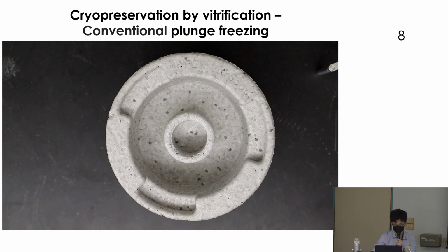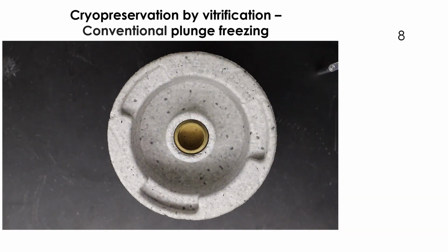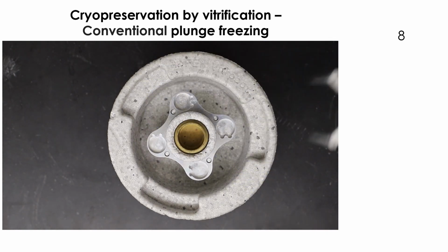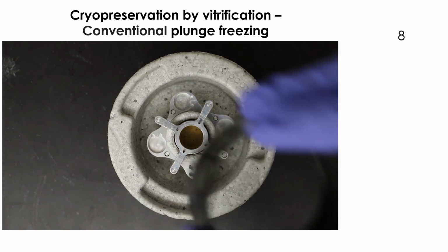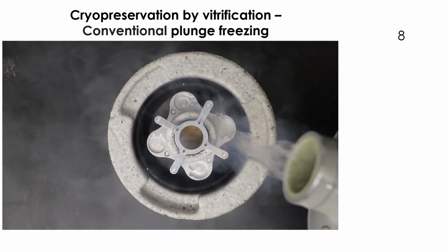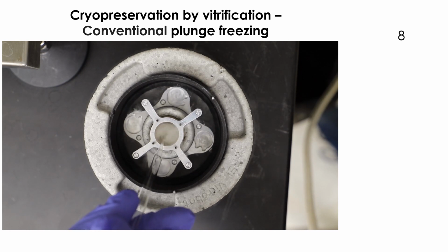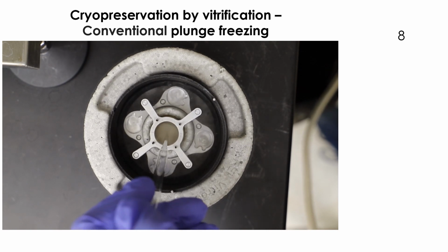Okay, let's start to take a look. In preparation for plunge freezing, a brass cup is inserted into the center of an insulated bowl, followed by the grid box pedestal, the spider unit, and a float. The assembly is filled with liquid nitrogen. After the temperature equilibrates, the brass cup is filled with a cryogen, typically liquid ethane.